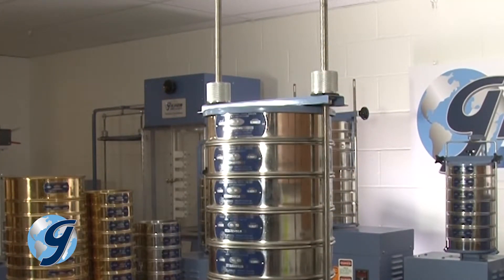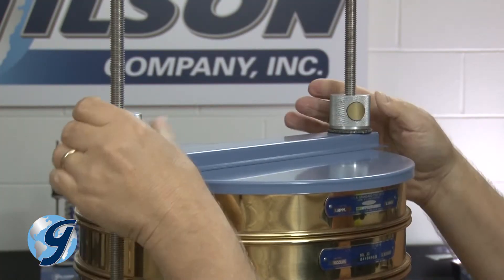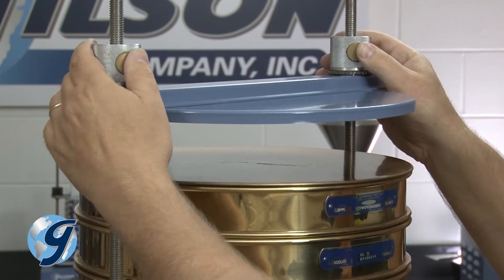Turn each knob to tighten the compression sleeve to the sieve stack. To release the sieve stack, unscrew the knobs enough to release the tension. Then depress the push button and lift the compression sleeve.